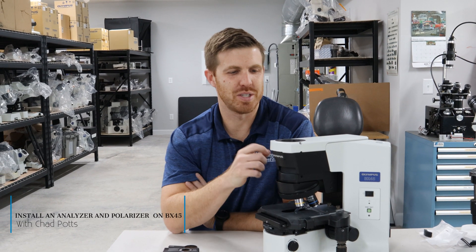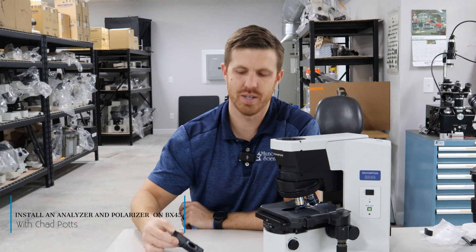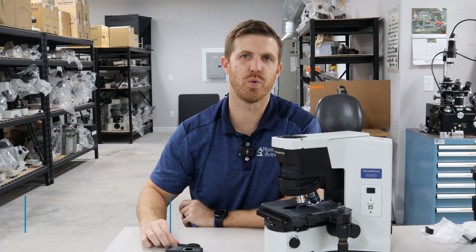Hey, this is Chad with Muncy Scientific. Today I'm going to show you how to put an analyzer and a polarizer on your BX45 microscope.